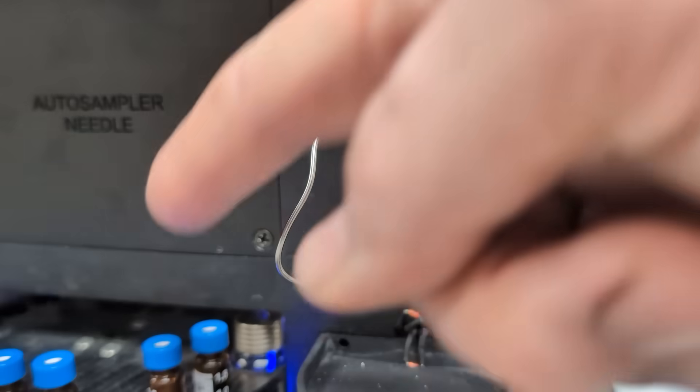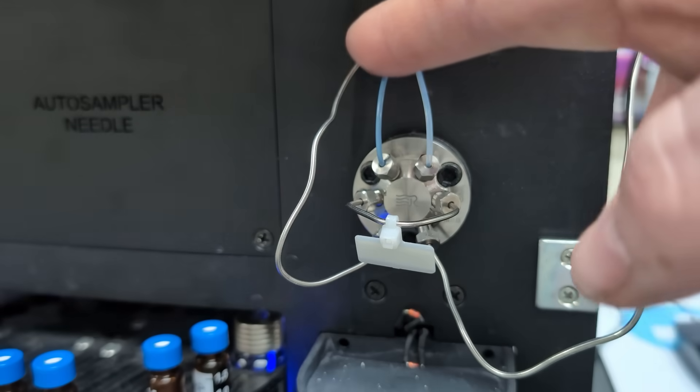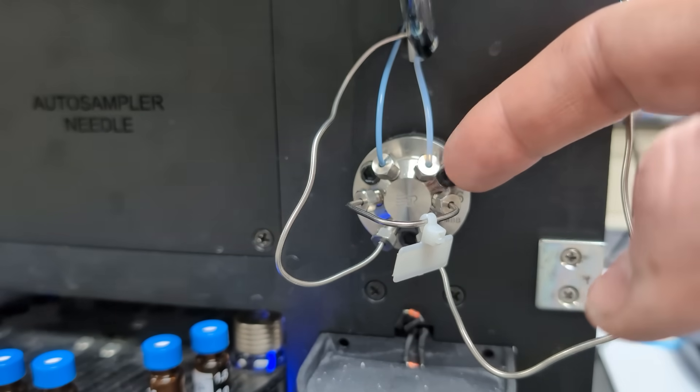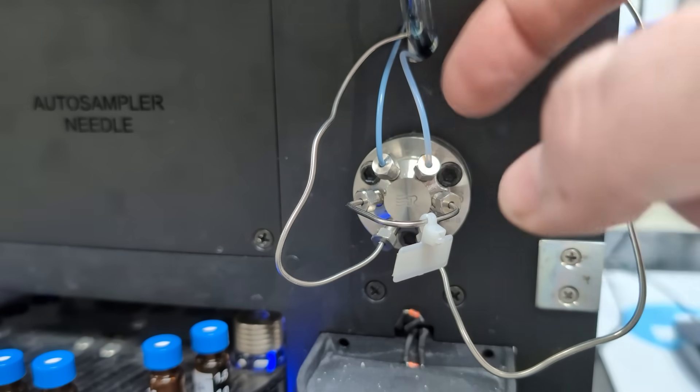You can see we have our injection valve here with some ports on it. Coming down this line here that comes from our needle, from our samples over here, through the needle, around the sample loop, and up on our sampling syringe side.